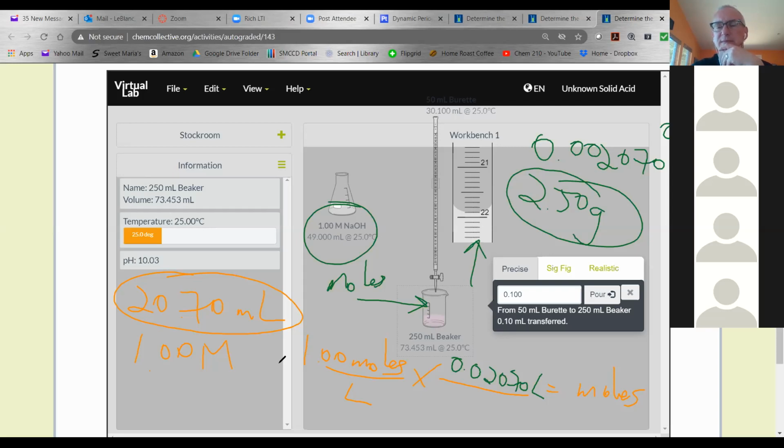You're trying to determine something. What was it? If the acid solution turns pink. Yeah, what does that tell? It turned pink, but it would have turned pink anyway. If we didn't add any acid at all, it would have turned pink. But what does that mean when it turns pink? That's the key thing. It turned pink for a reason. An equivalent amount of NaOH and equivalent amount of unknown acid. That's an even amount. Yes, exactly. Amount in what? In what measure?